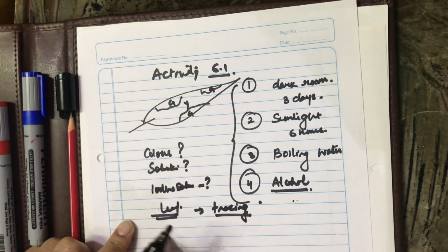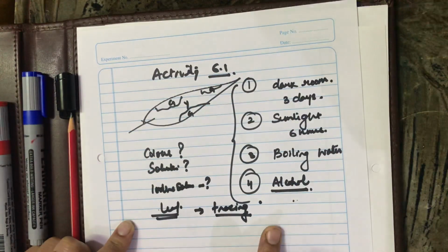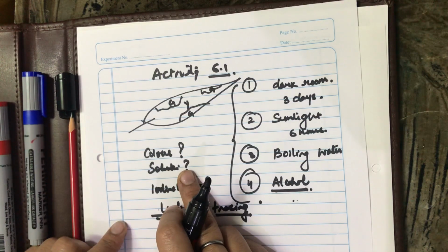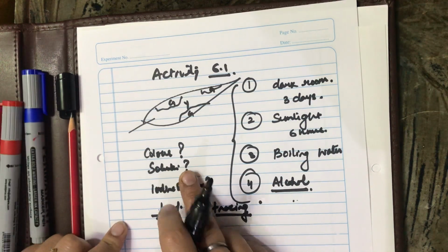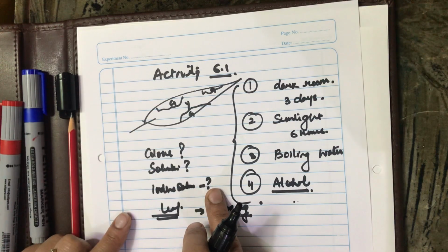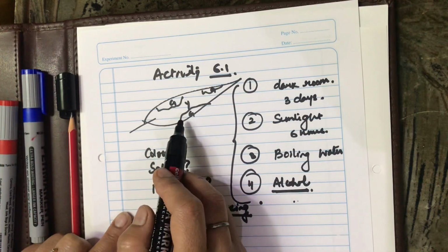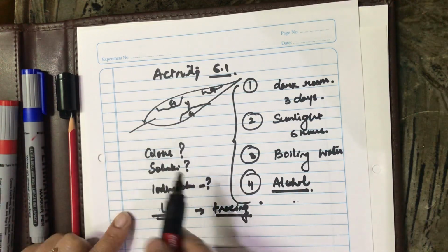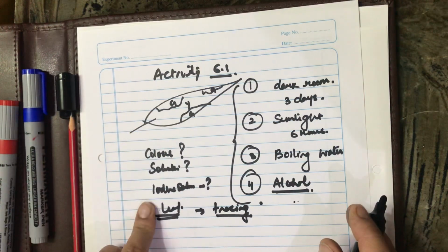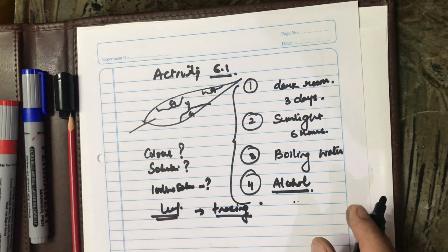For all those questions, first of all, when we take up this procedure, it will decolorize and the solution will turn light pale yellow and green in color. When we dip it in iodine solution, obviously the part of the leaf which is green in color and performs photosynthesis will only show starch, and that will surely give the iodine test. Rest, this yellow region will not perform the iodine test.